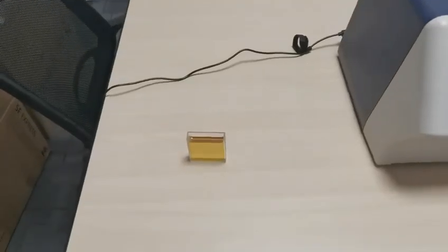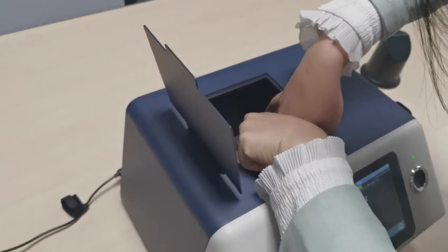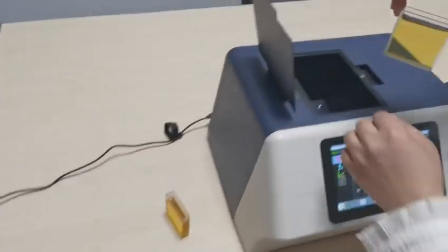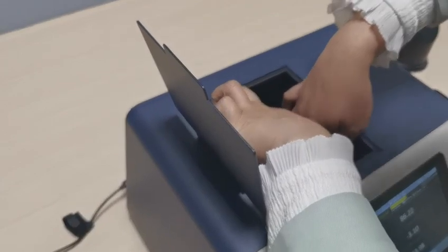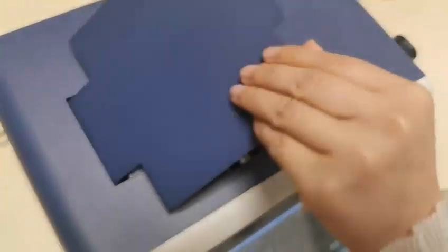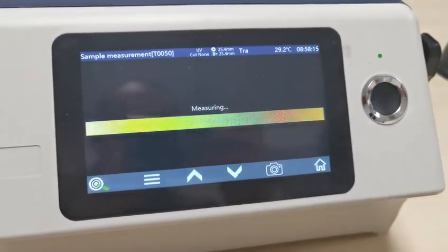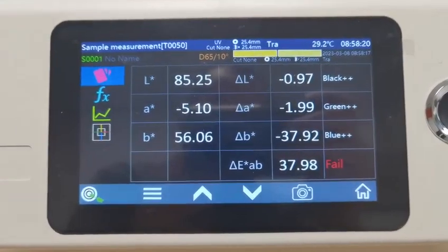Put the sample in the cavity. Put out the standard first, and change the mode. Press the button. Here is the color difference — it's quite a bit.